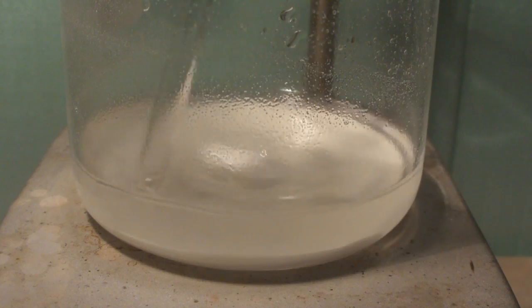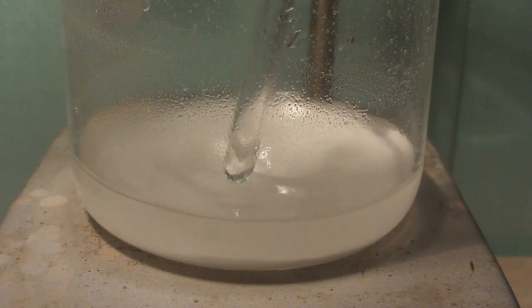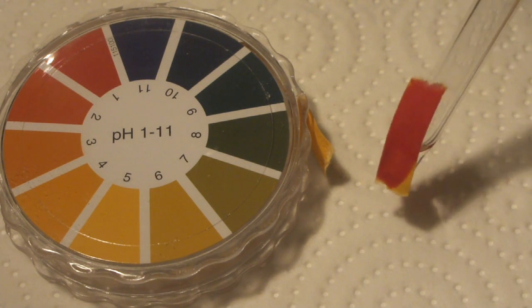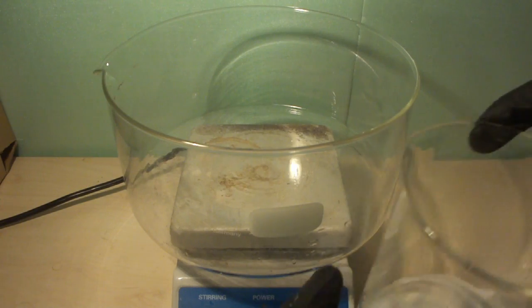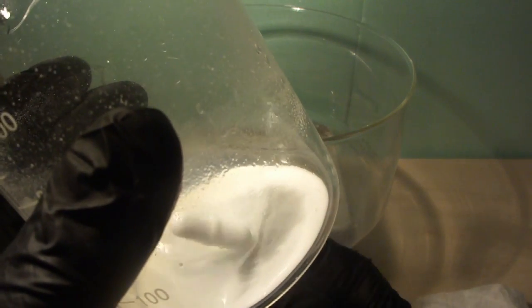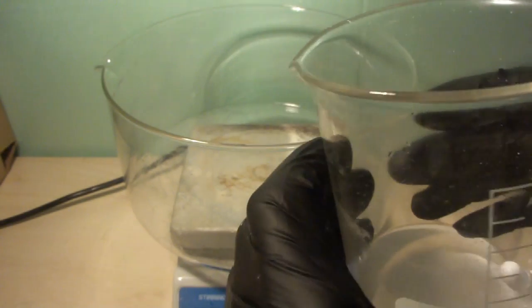Let's check the pH to be sure. If it is neutral or slightly acidic, we're done. We now have a solution of barium nitrate in water. All that's left is to evaporate our solution down to dryness to obtain our crystalline barium nitrate.